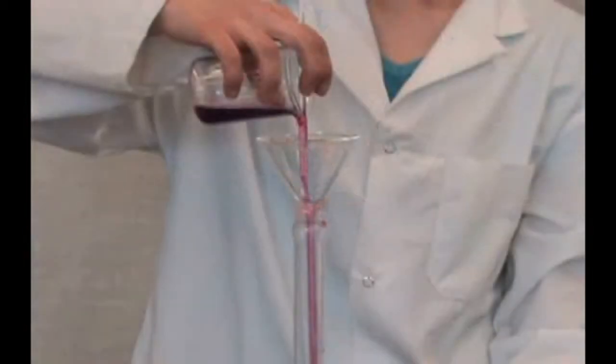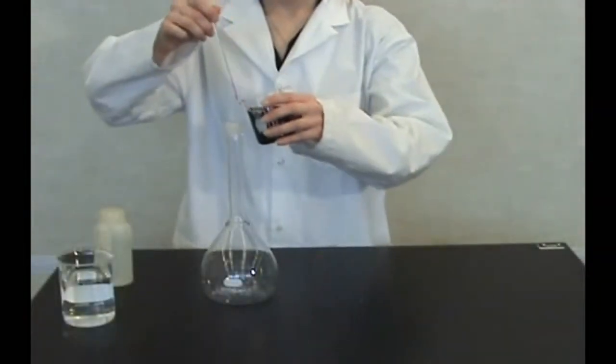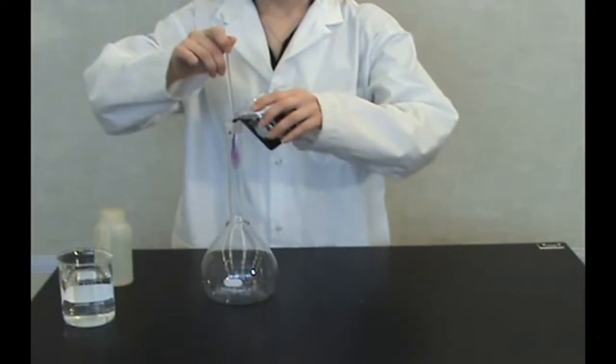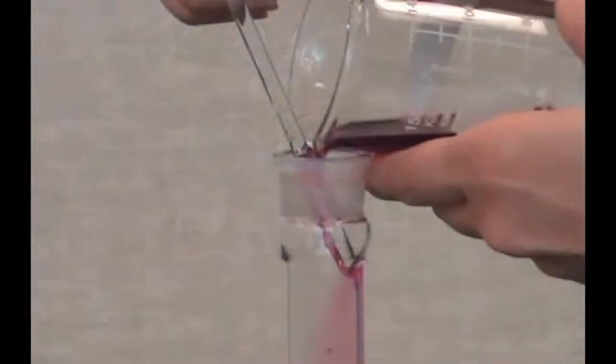Use a funnel to pour the solution into a thousand milliliters volumetric flask. Or if capable, use the glass rod holding it against the spout of the beaker. Make sure the tip of the rod touches the inside of the flask neck to control the flow.